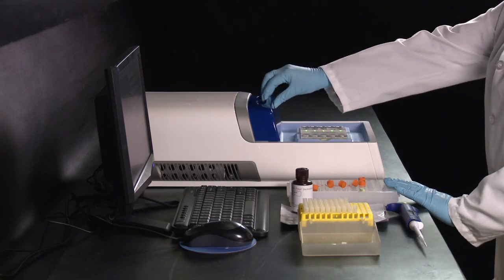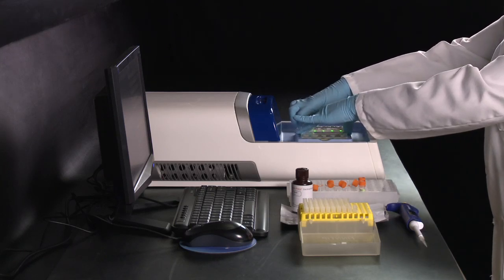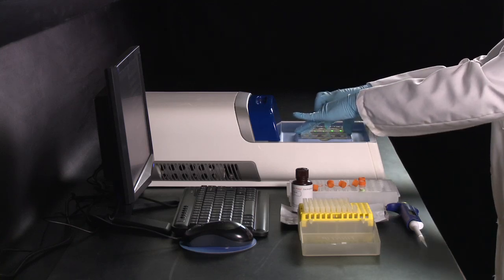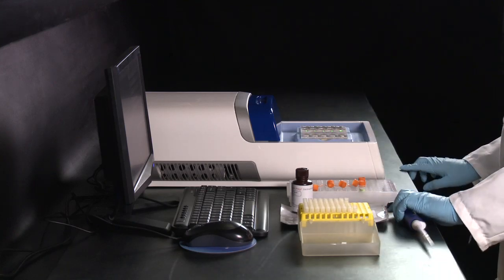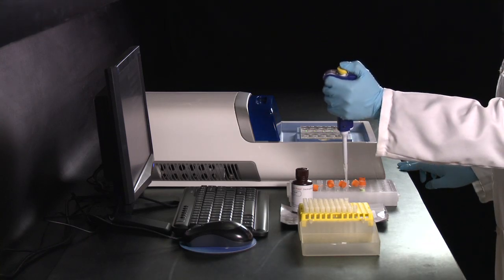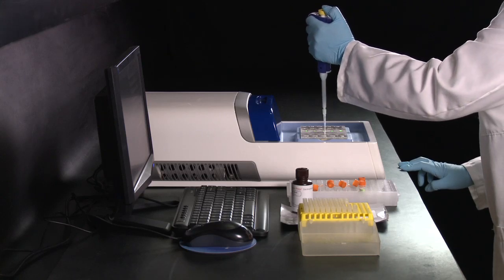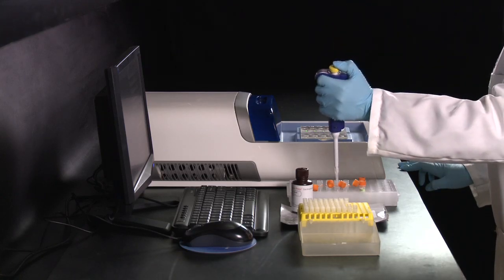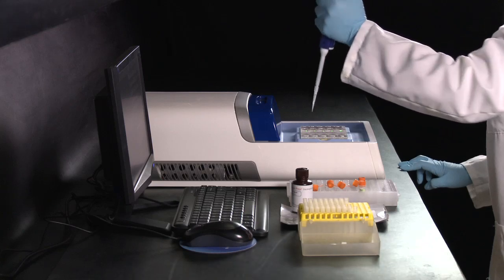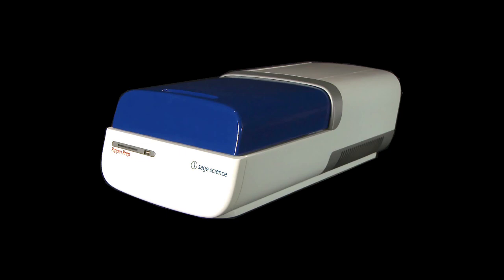Open the lid. Remove the tapes covering the elution wells and pipette out your samples. The Pippin Prep: four size selections, minutes of hands-on labour.